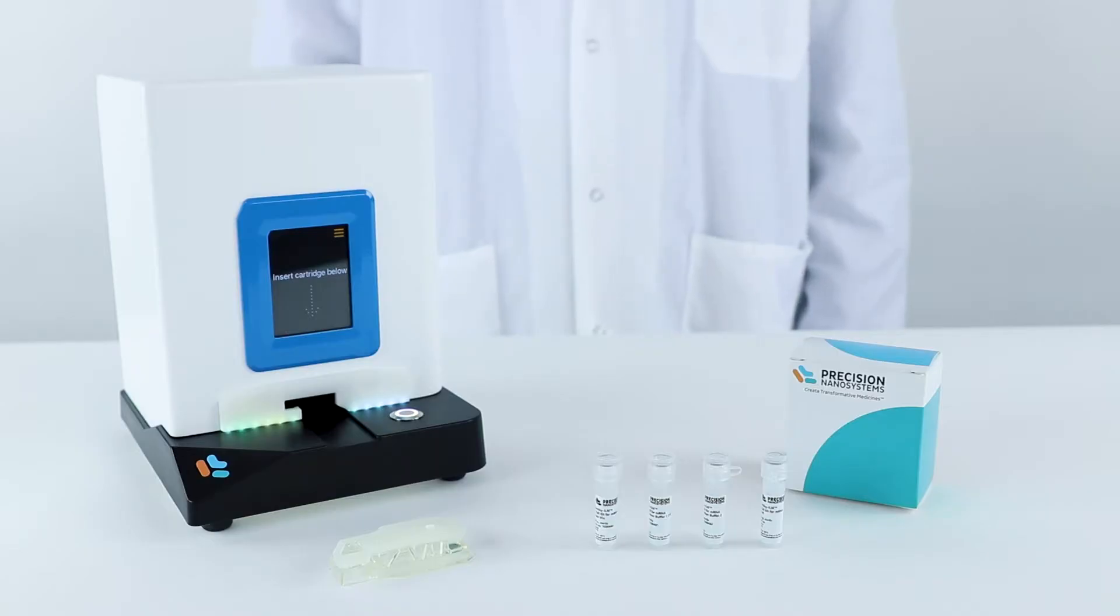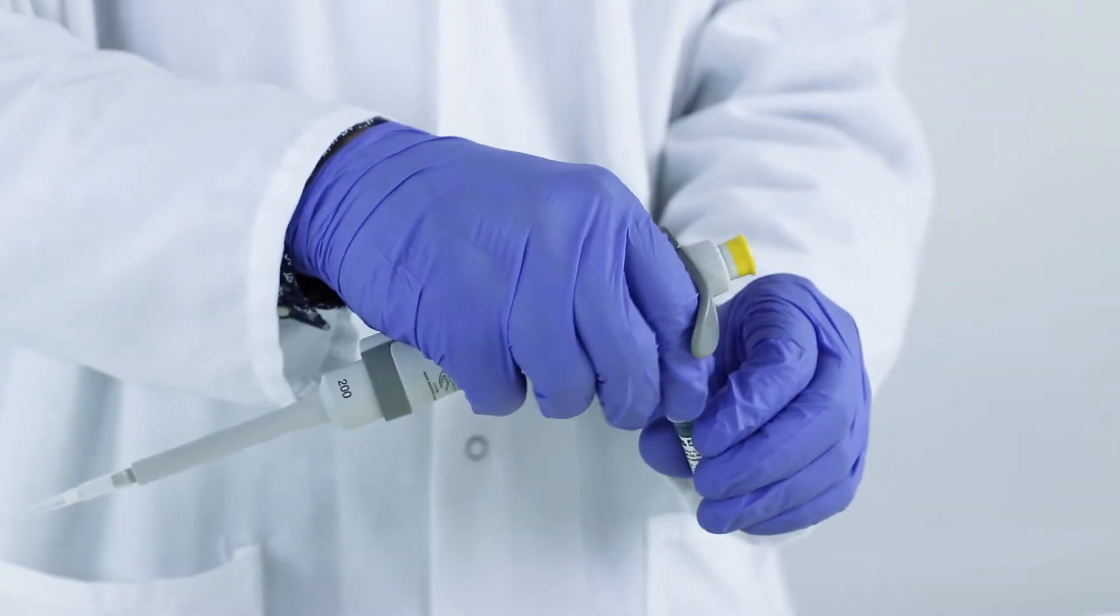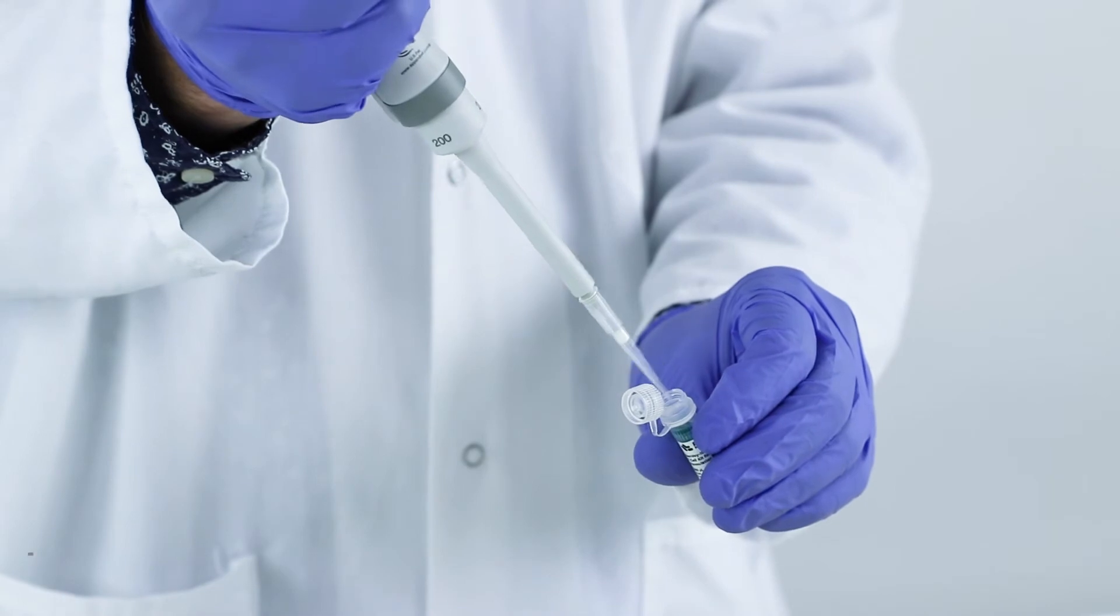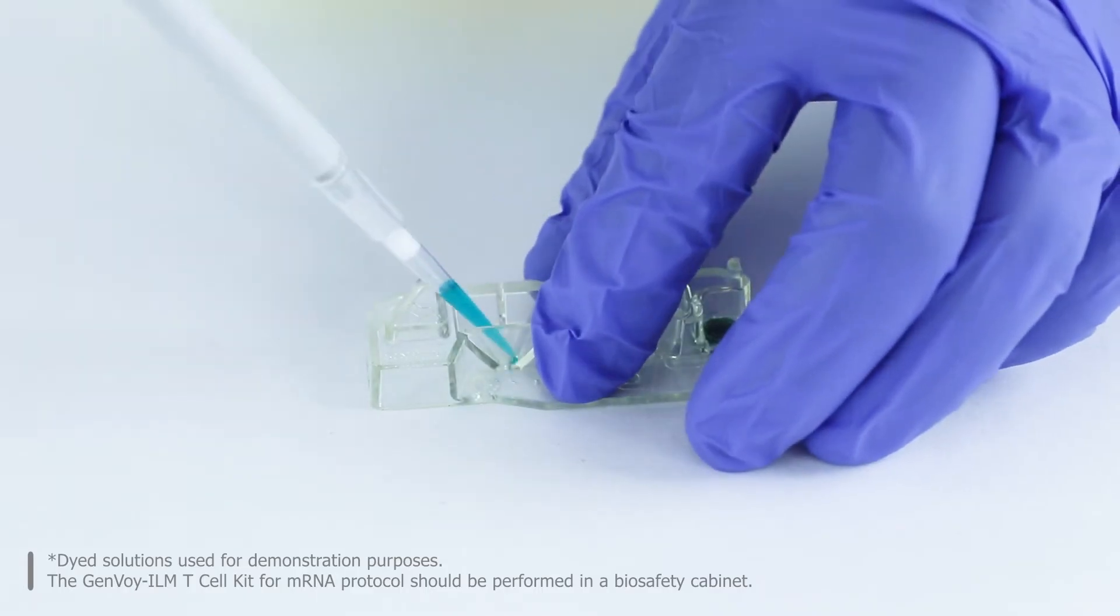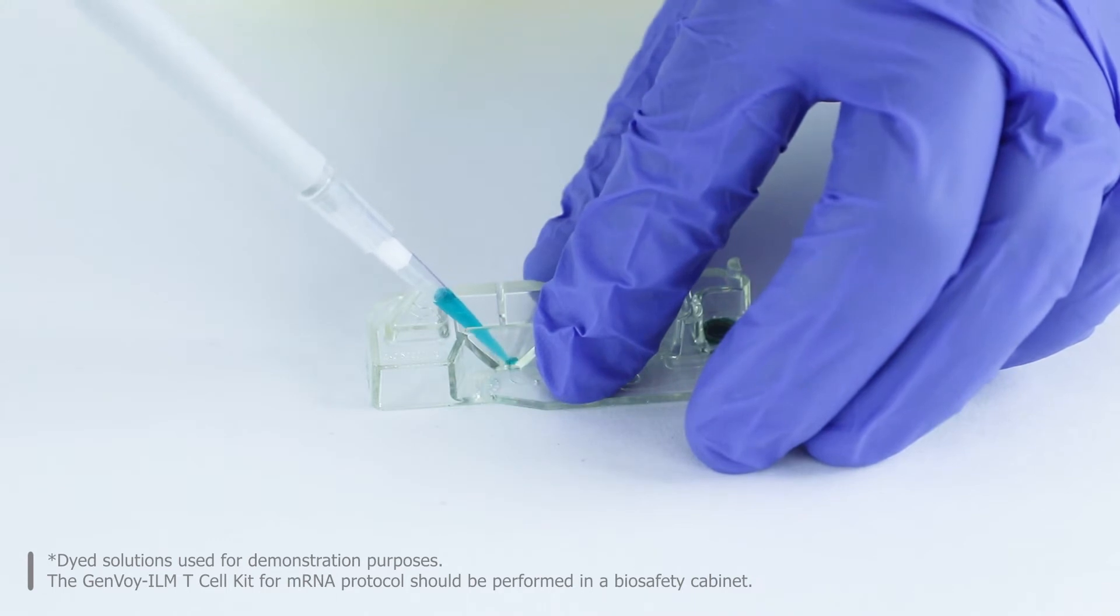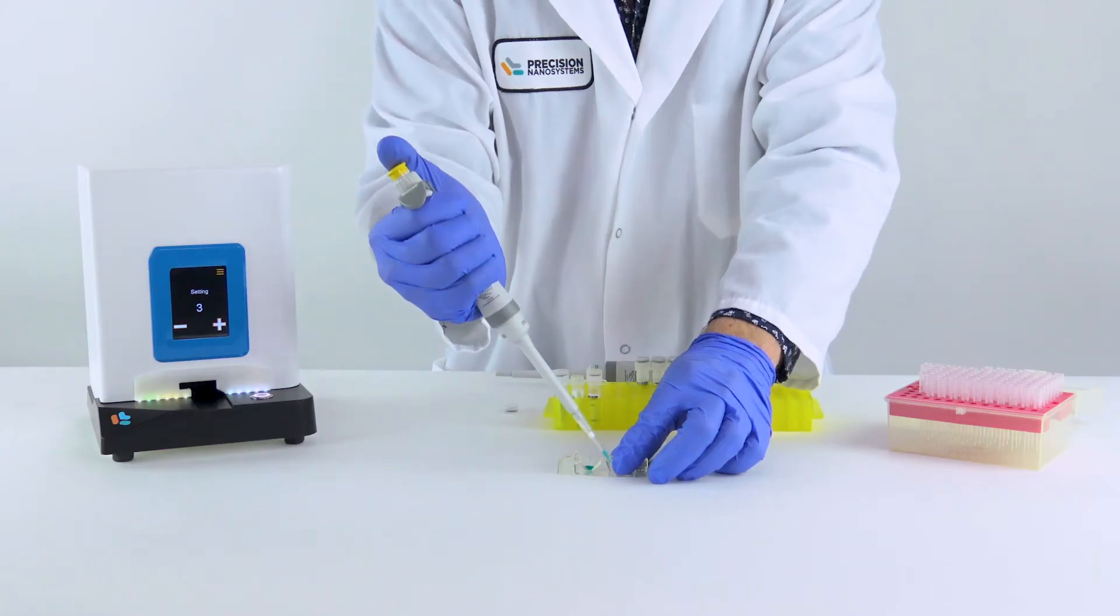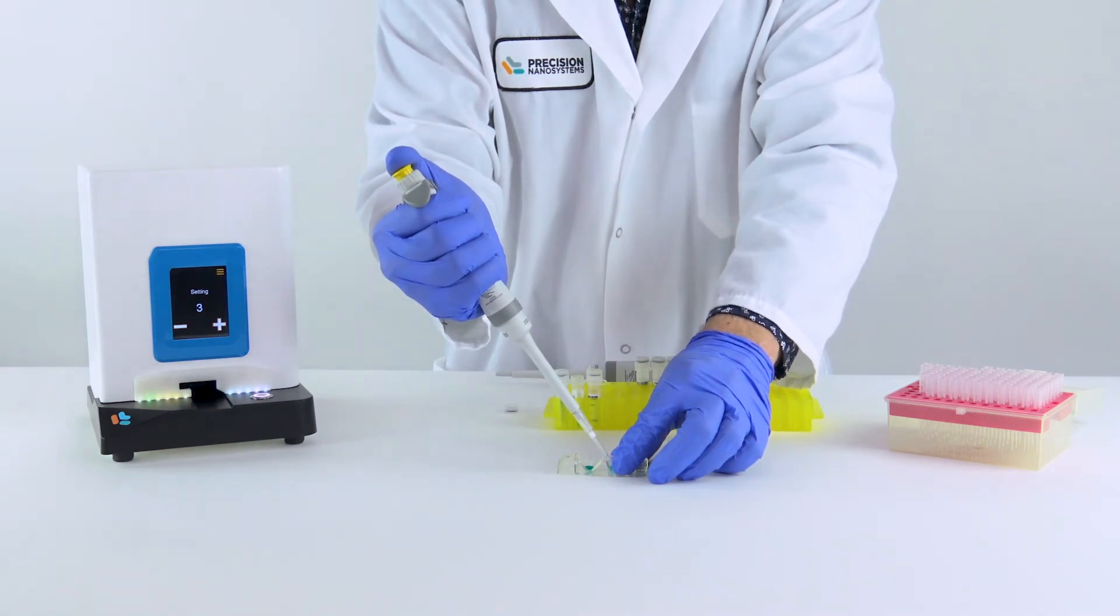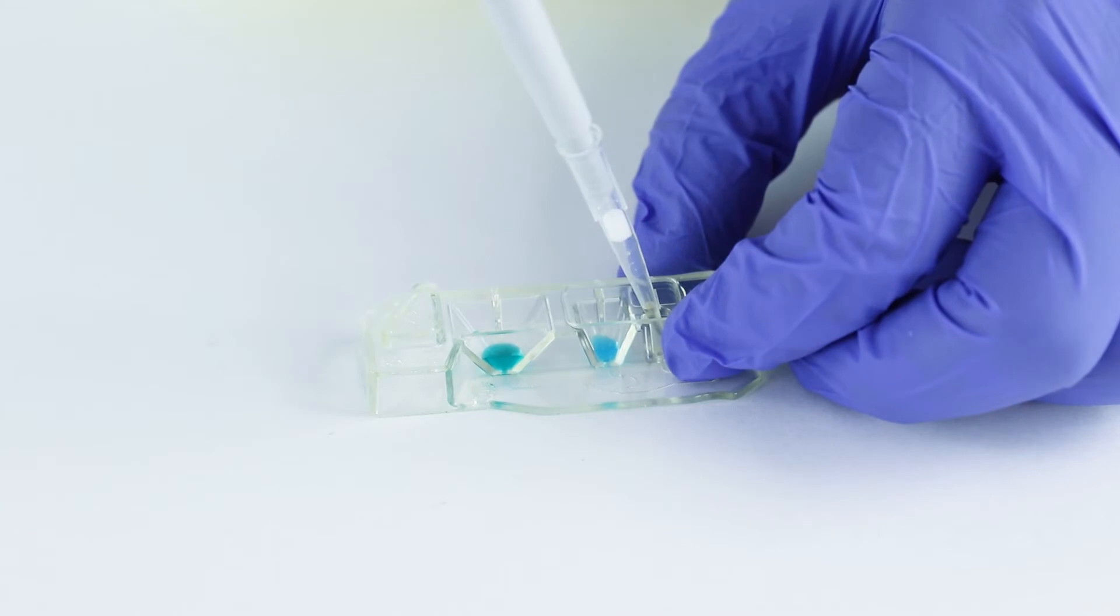Let's take a look at how mRNA lipid nanoparticles are made on the SPARK. Simply add the formulation buffer to your mRNA working solution and the lipid mix into the appropriate wells on the SPARK cartridge.